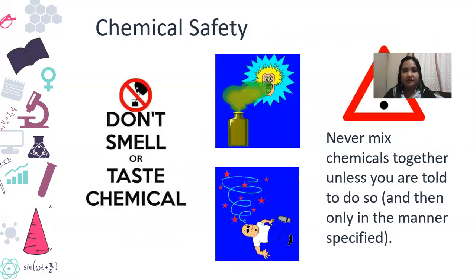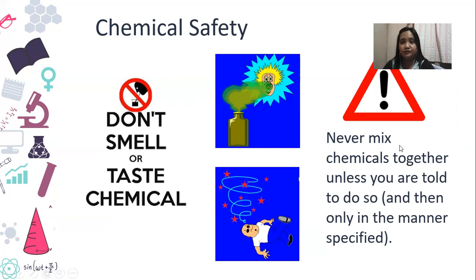For chemical safety, please do not smell the chemicals. We are there to use the chemicals, to mix some chemicals, but not to smell or taste them. Please, some of the chemicals are really harmful. Also, I am asking you not to mix chemicals together unless you are told to do so.